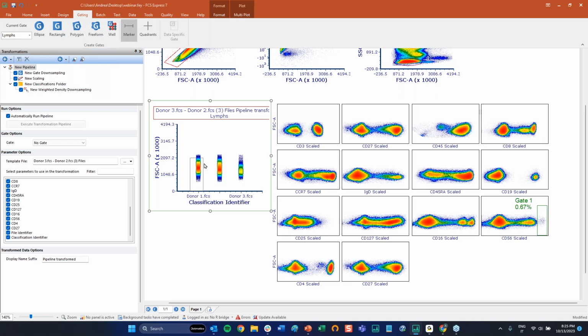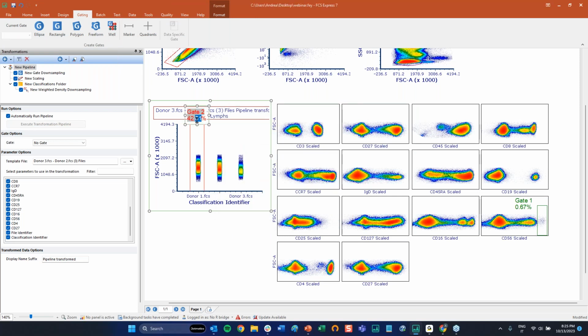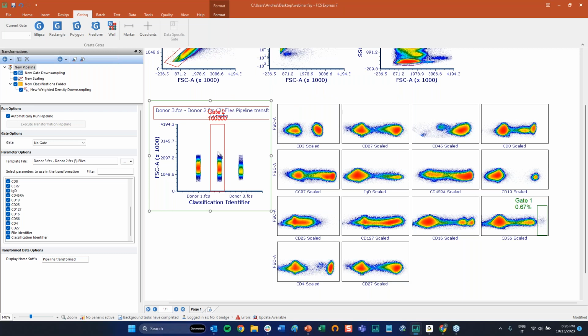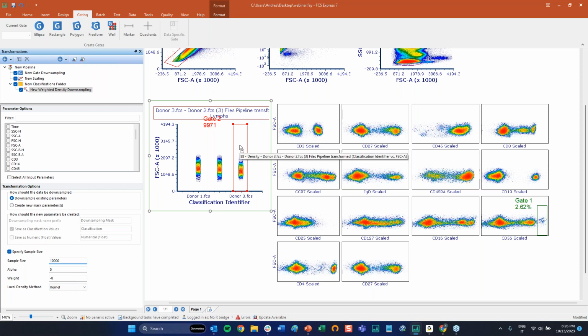And here we go. So what happens, for example, if you do not have enough events from a file? Well, this is exactly the situation. Let me show you the number of events. So file, this is 100,000 events. This is 100,000 events. And file number 3 was really small. You see, we don't have enough events, so we'll basically keep all of them, ideally. If I lower it down to like 10,000, let's see. Okay, now we're quite close to having the same number of events.